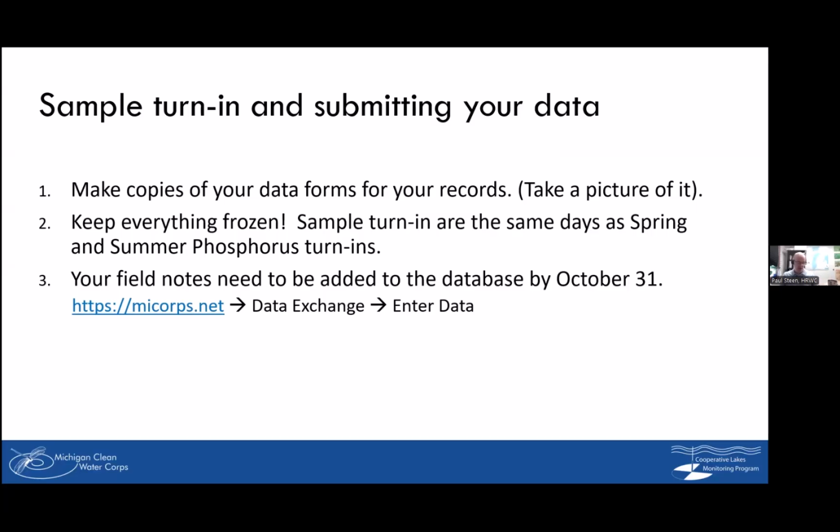You keep them wrapped in aluminum foil, like the video showed, and they stay frozen until the moment you turn them in. So even when you're driving to your turn-in location, you should have your frozen samples in a cooler and they're on ice. So you keep them frozen up to the minute that you turn them in, and then when you turn them in, your turn-in person should be putting them into a freezer as well. And then they actually get shipped in freezer packs to Joe. So this whole process, everything stays frozen.